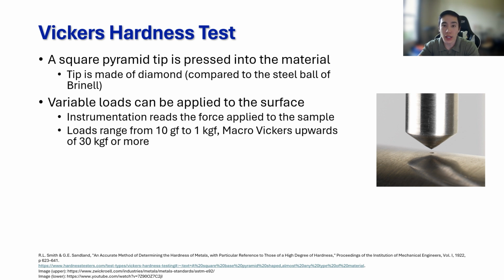The load and dwell time are controlled by the individual performing the test prior to the application to the sample, and most equipment can apply loads anywhere between 10 grams force to 1 kilogram force, with some macro Vickers going all the way up to 30 kilograms force.